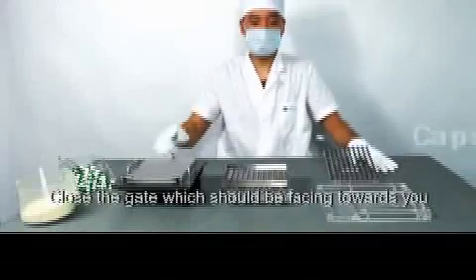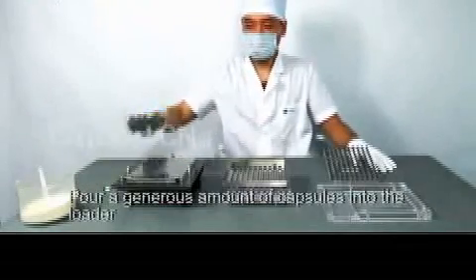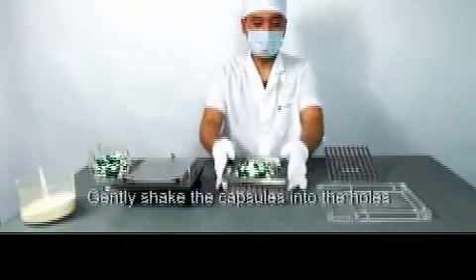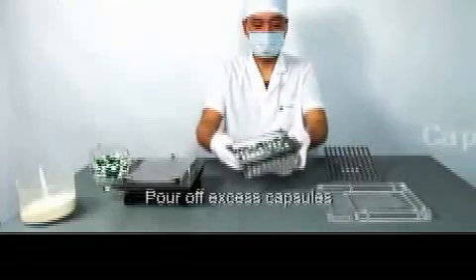Close the gate which should be facing towards you. Pour a generous amount of capsules into the loader. Gently shake the capsules into the holes. Pour off excess capsules.